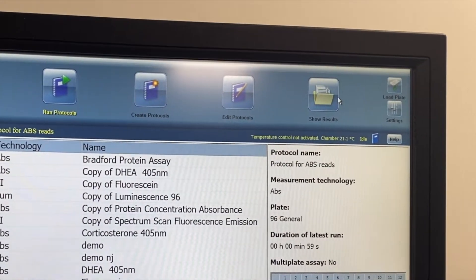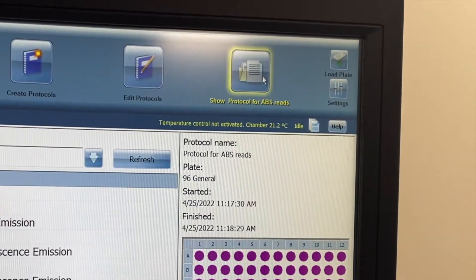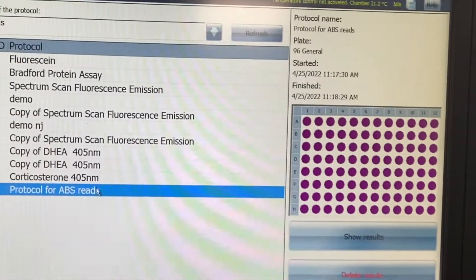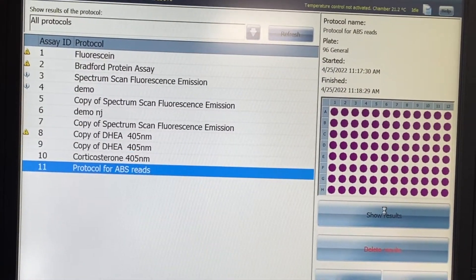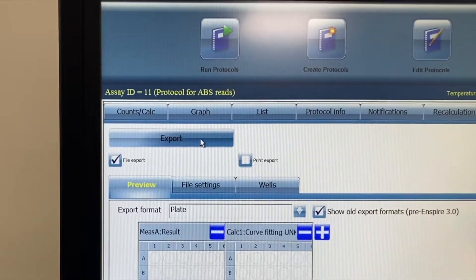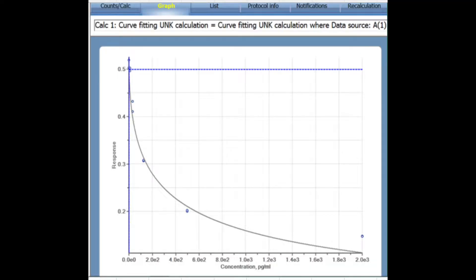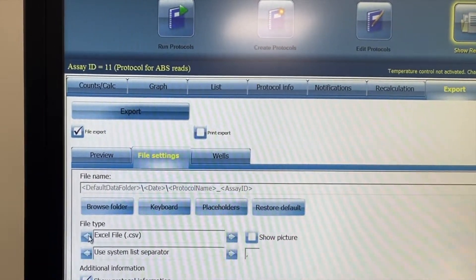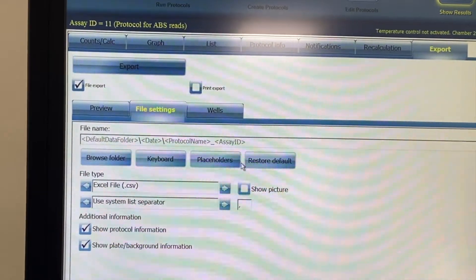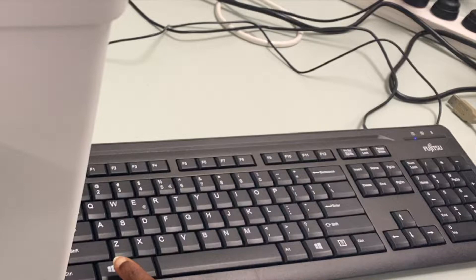This test run shows all zeros, but if you have actual samples in there it would give you the readouts. Once you've read your plate and want to access your results, they will pop up automatically, but to access a previous result go to 'Show Results.' Highlight the protocol you ran it under, then click Show Results, and from there you can export the result in the format you need. In file settings there's a CSV option; if you want to export a graph use the MHT format, which is the visual representation. In Excel you'll be able to see your files from the CSV.